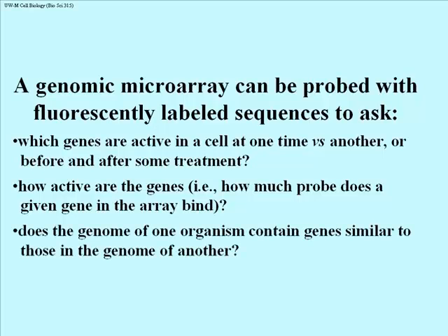And we can ask simple questions of paired microarrays, for example, of two different organisms probed with similar probes to ask whether the genome of one organism contains similar genes to that of another. So that's another use of microarrays. And here it is actually quite limitless. One can imagine many different questions that you could ask using microarrays that get at genome-level questions.